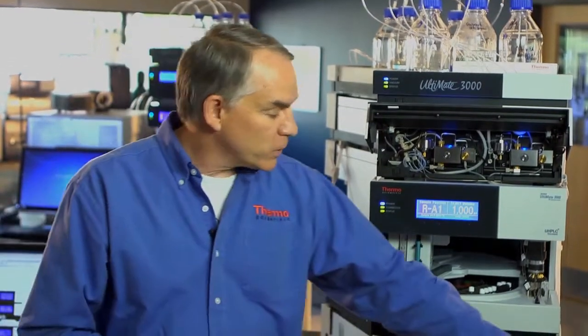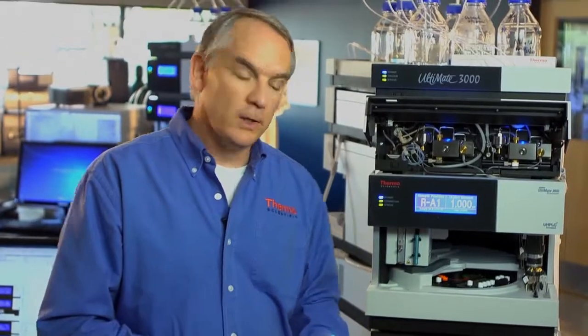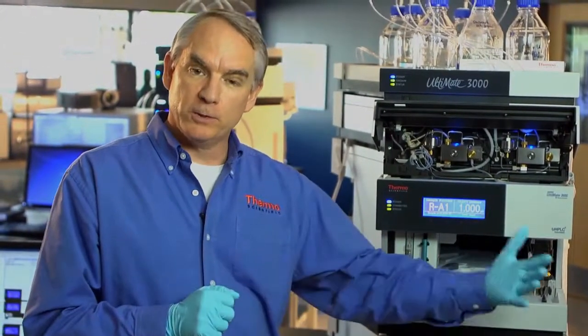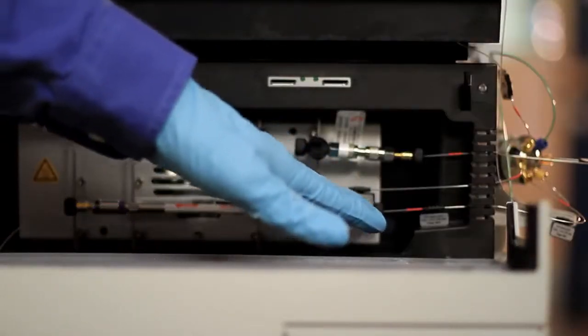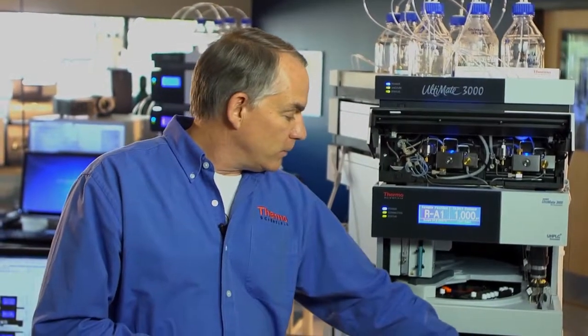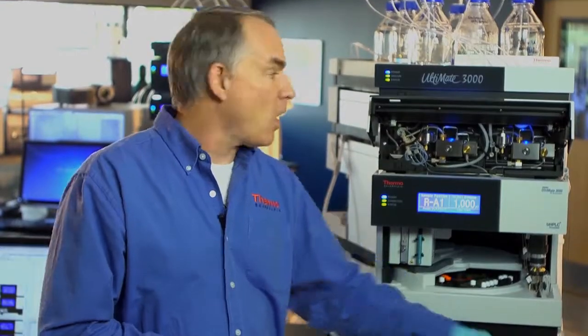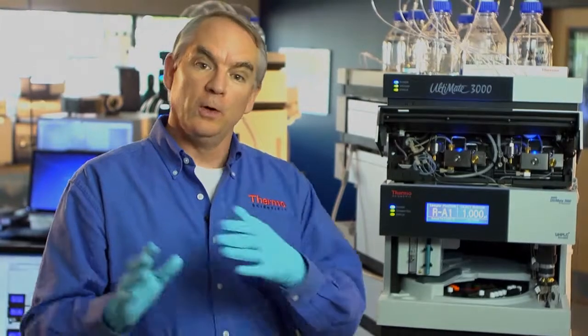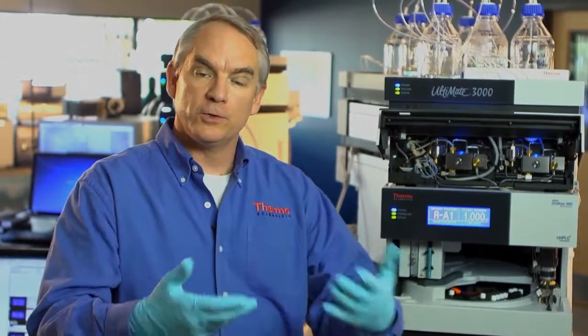In the next step the switching valve is going to switch the analytes which have now been enriched, matrix depleted. The analytes are going to be pushed into the analytical column where we can separate them and detect them. During that separation step the solid phase extraction column now can be treated with the left pump which is a gradient pump to clean it up to remove strongly bound components and then equilibrate it in preparation for the next run.